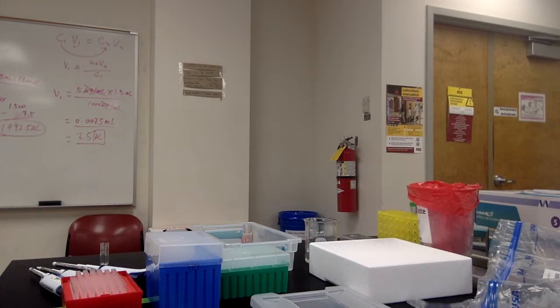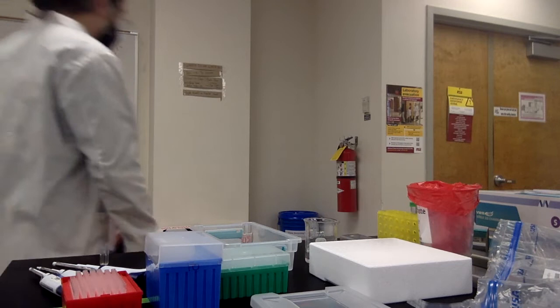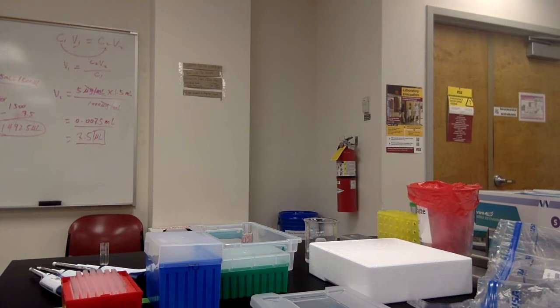Can I tell you what I got for the second one? What do you mean? So this is for 8, right? Yeah, 8 times 1.5. That's 12 microliters plus how much water?